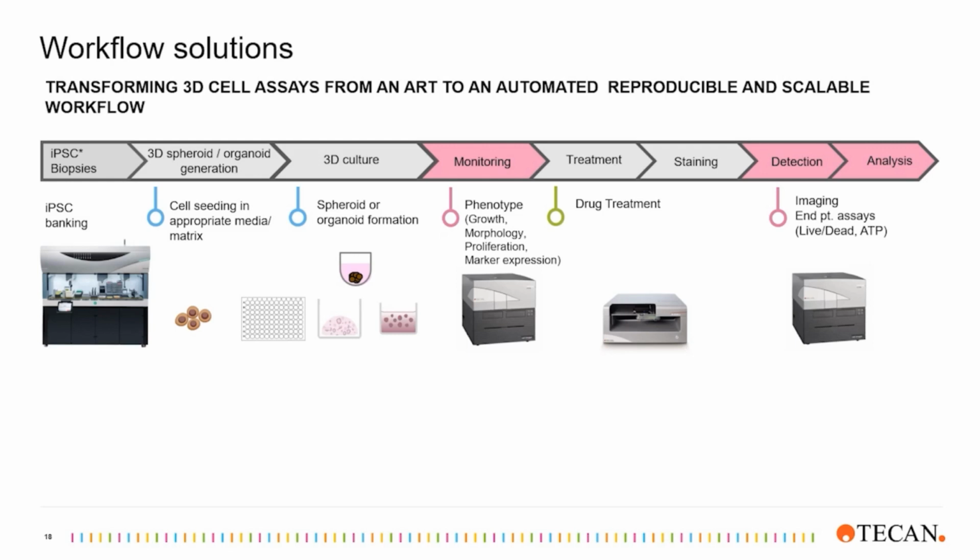To visualize the effect of the drug, for instance, if an anti-cancer drug was able to induce apoptosis throughout the tumoroid or just on the periphery, the 3D model can then be stained with a cellular dye or antibody-coupled molecular markers. Also, at this step, the Fluent might potentially automate the staining procedure.